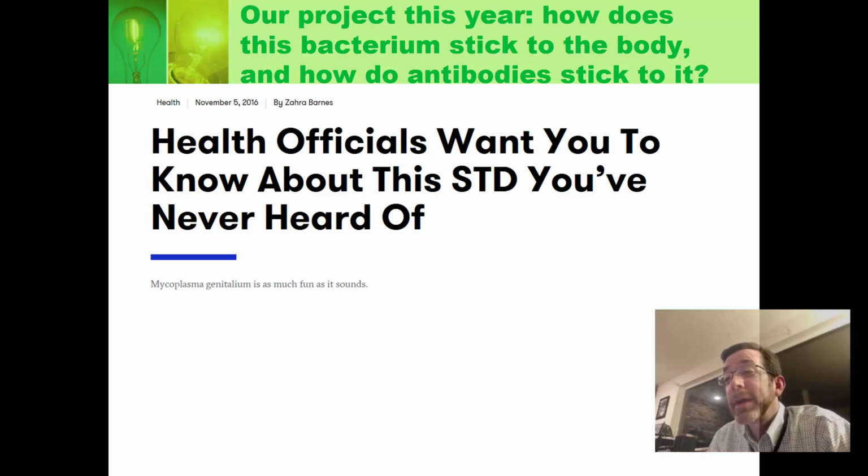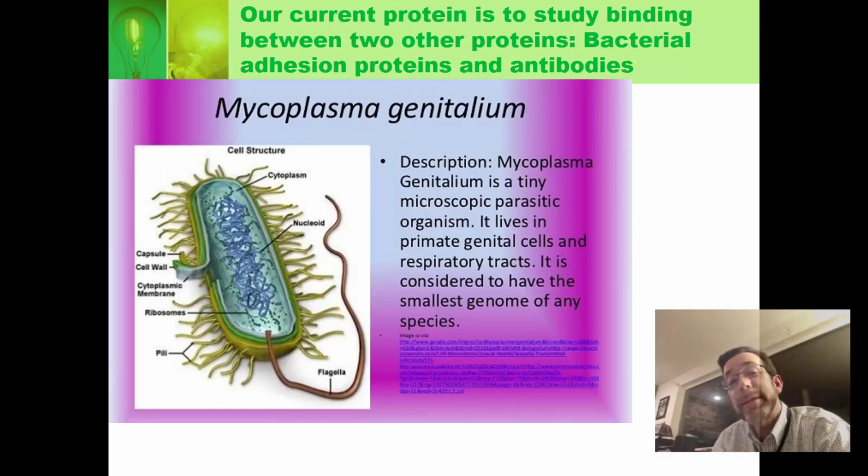Well, we're trying to cure Mycoplasma genitalium by looking, and again, we're not using the whole mycoplasma. Don't worry about health things. We're just looking at the proteins. We're just looking at purified proteins and how they stick to each other. But that's how the bacterium sticks to the body. So let's investigate that and let's try to solve this problem.